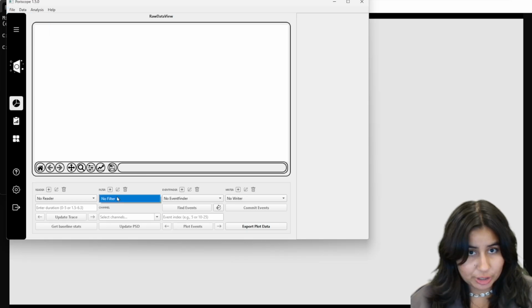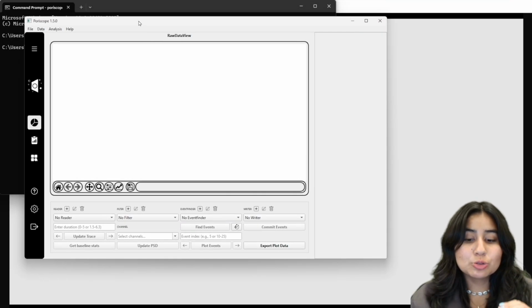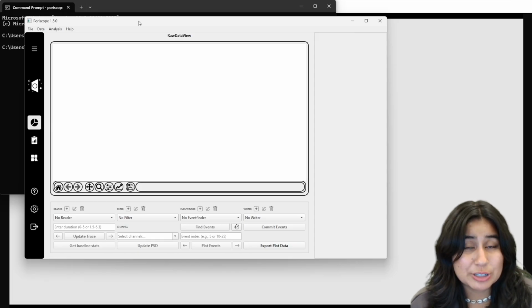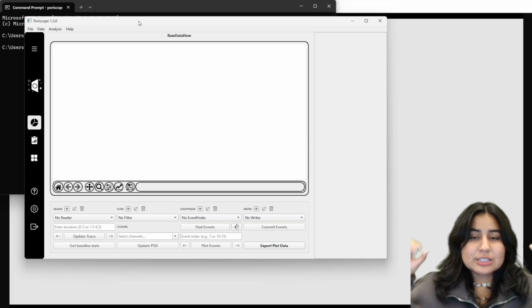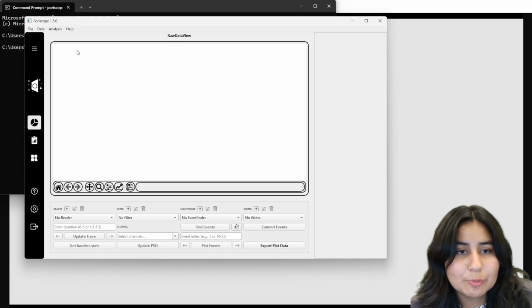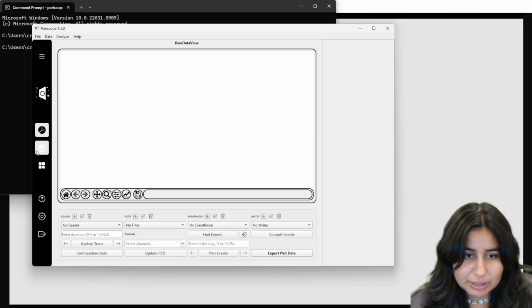It will not work because I have taken a different action. Because the moment you click on something, on a plugin in particular, that means you're taking a set of actions. You are instantiating certain elements, which means that it's gonna record a different session. So next time, what it's gonna load back is the fact that I instantiated the raw data view and not the filters, because that's not what I did.